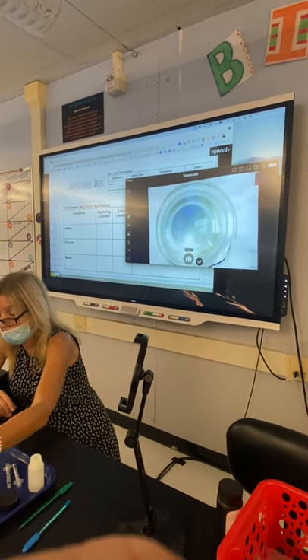So now I'm going to take a look at the bag — what color is the bag? Clear. So now I'm just going to put this bag inside of the beaker and then we're going to look to see — it's funny how there's a delay — how that changes. While we're waiting a little bit, you could look to your drawing that you need to do. This drawing right here — you could color this. The bag is clear and the beaker is kind of that golden brown. You can use colored pencils on the copy and on your original.